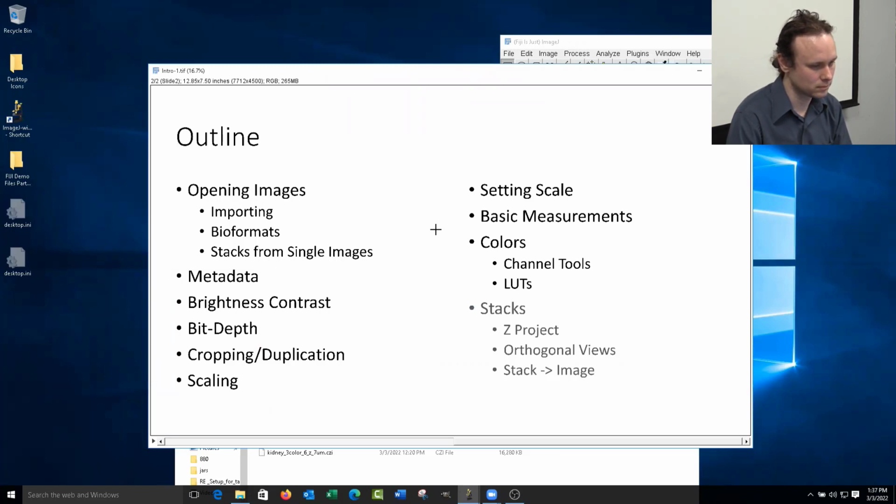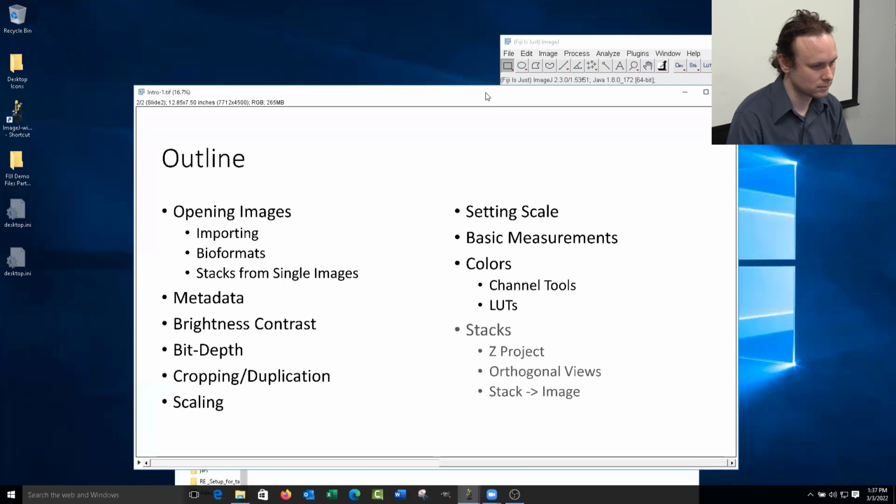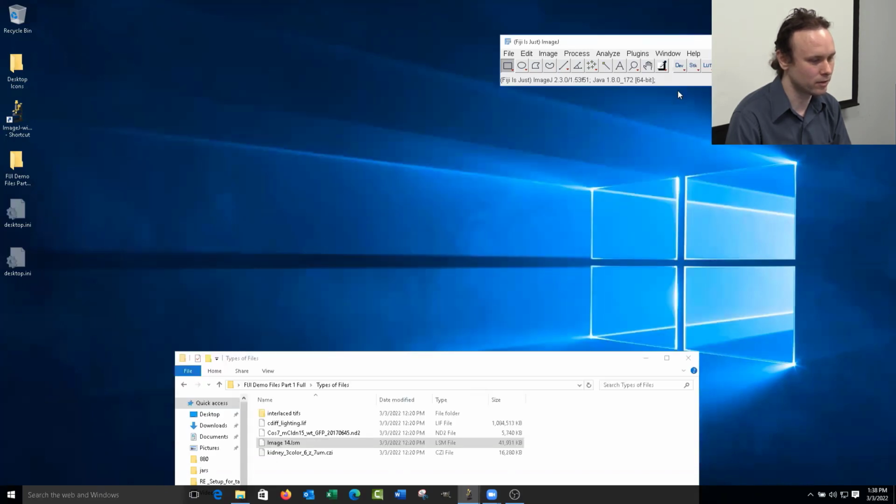This is a really common thing in FIJI, so that you're not changing your data in a way that you can't get back. It's just a good habit to always copy before you make your adjustments. And like you can see, like I just said, it might come in two different ways, either keep source or find the duplicate. Either is fine. They're basically the same thing.